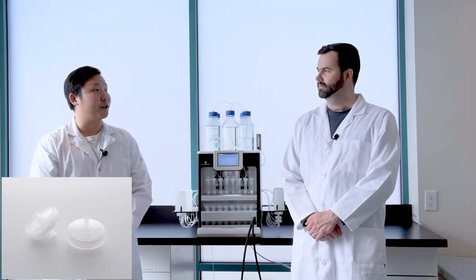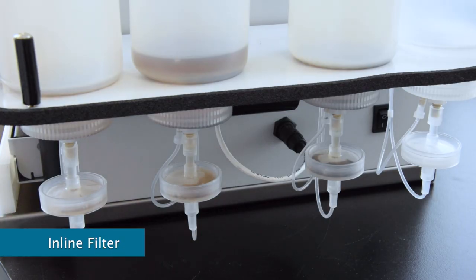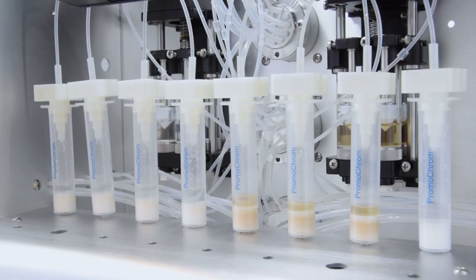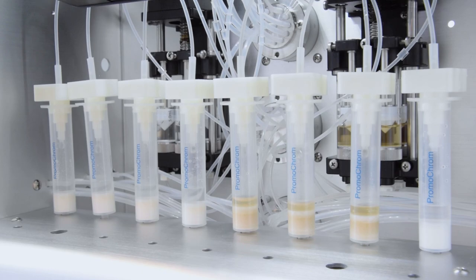So before we start extracting, can you tell us more about these inline filters and how they handle different matrices? Of course! As the name suggests, the inline filter is connected directly to the sample line. It serves to keep out sample particulates that can A, clog the SPE cartridges, and B, wear out the internal components of any automated system.